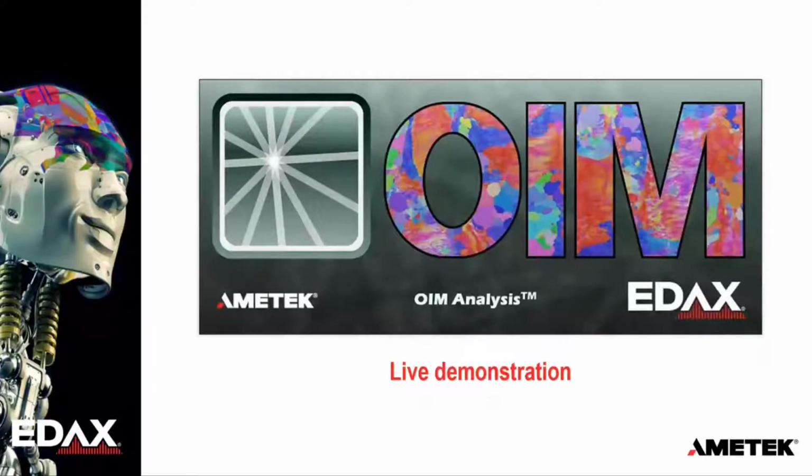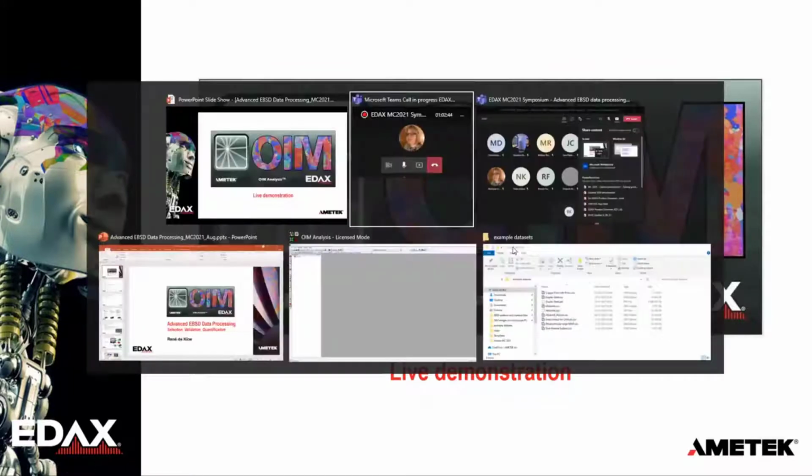Okay, so these were a lot of slides. I want to quickly show you how you can work with the software, just for a few minutes, and then if you have any questions, just let me know. So let me switch to the software. So here we have OIM analysis. I've shown the toolbars, the area of analysis.